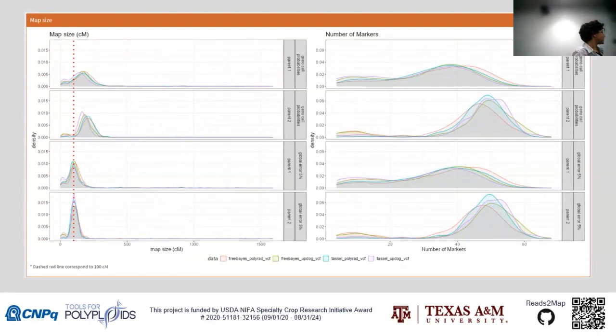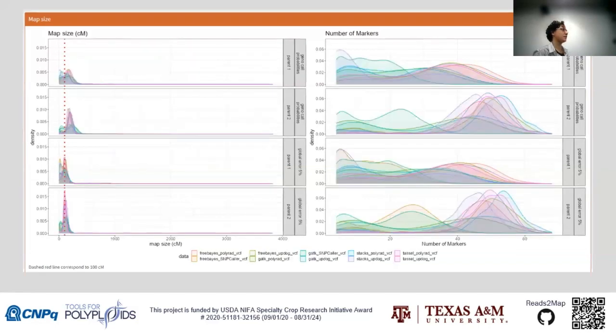And I didn't have these results yet, and I told our PhD student that had just done the GBS, okay, just run Stacks and updog. And we didn't have good maps, and it was like, oh, what happened with the data? But for the polyploid data, Stacks was one of the worst. Stacks with updog, the purple one. So it was not a good one. I shouldn't put a graphic about that, but I just thought of it now. Oh, okay, I get excited.